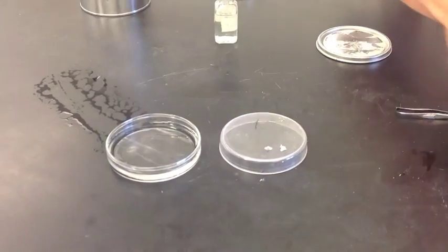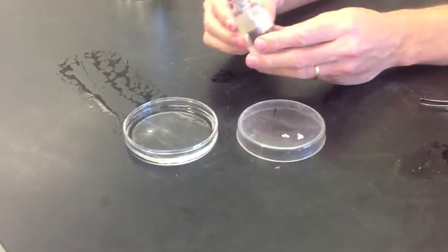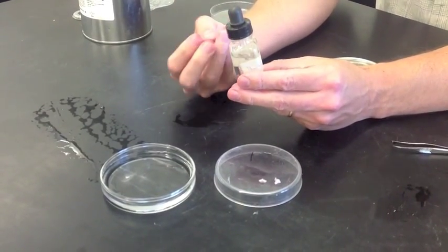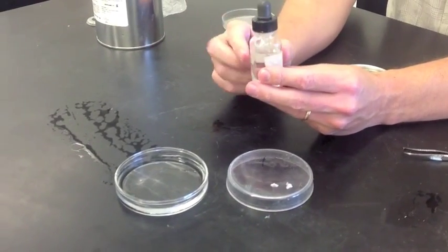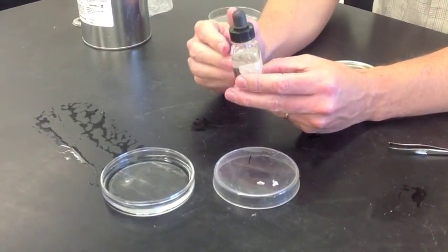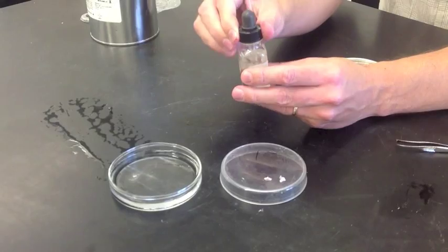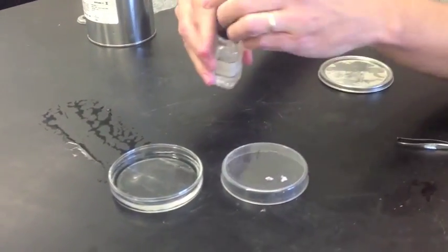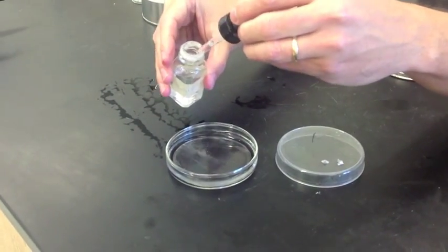Now we're also going to treat the water with something called phenolphthalein. This stuff is a liquid that turns color when a base is present. It's clear when there's no base and it turns pink when there is a base. So if there's a base produced, it should turn pink when we add the sodium.